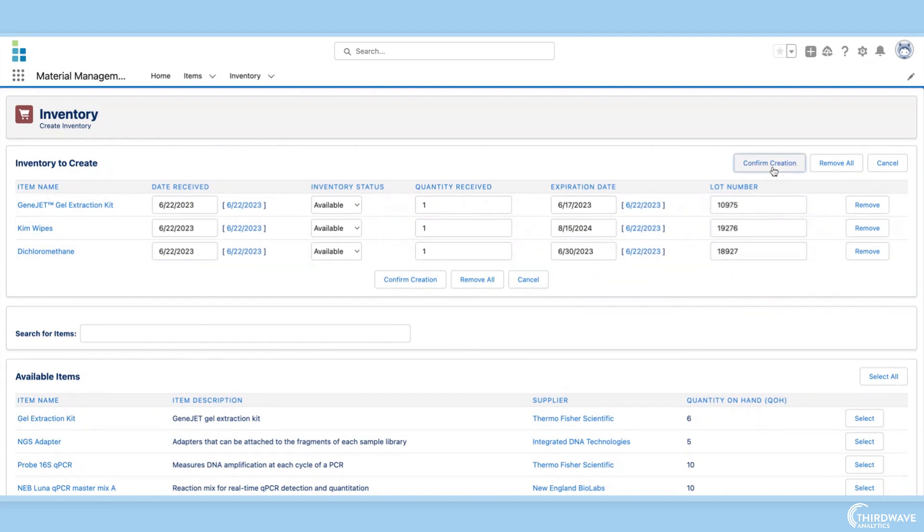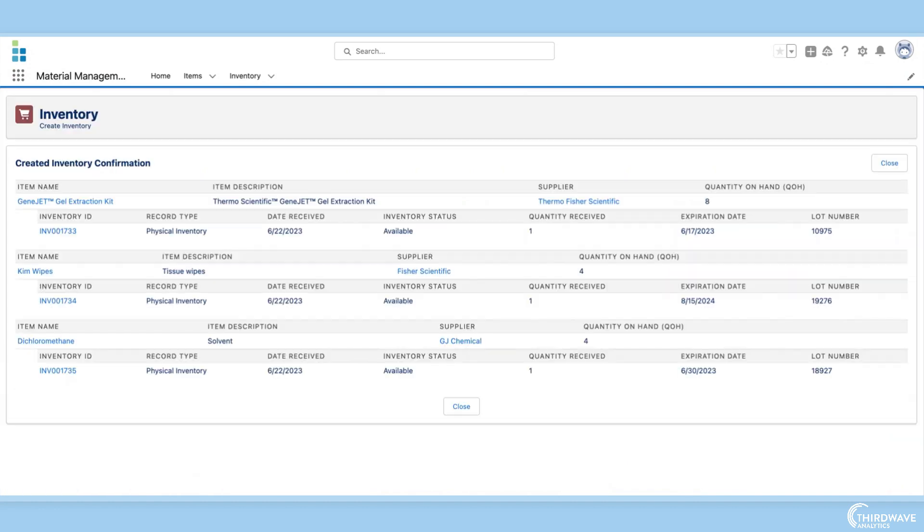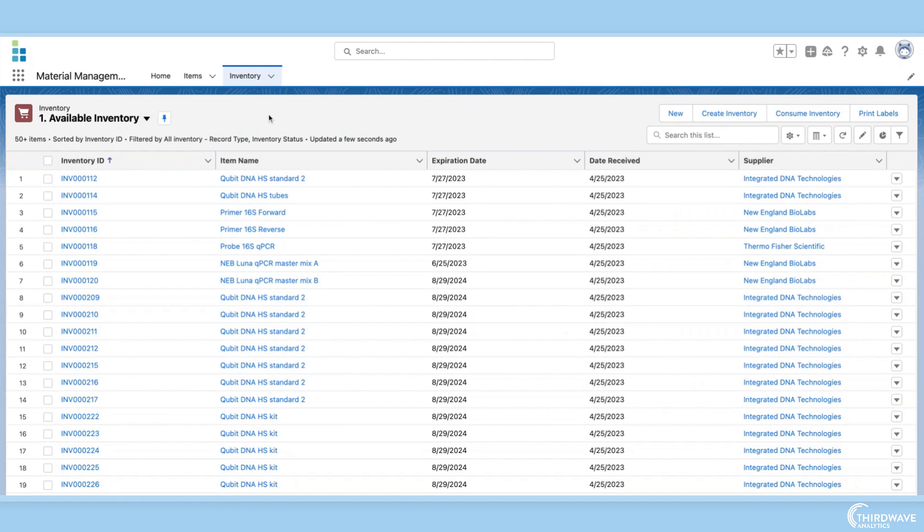Lockbox can track both countable discrete materials such as plastic consumables and reagents that have a defined number of reactions, as well as measurable materials such as chemicals, powders, and liquids that are consumed as portions of a whole.